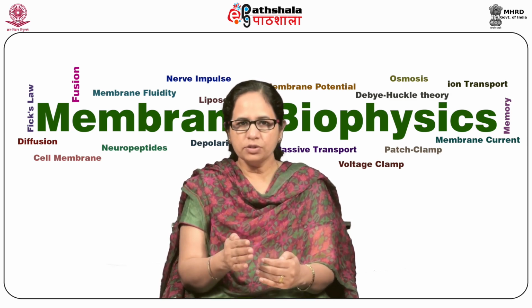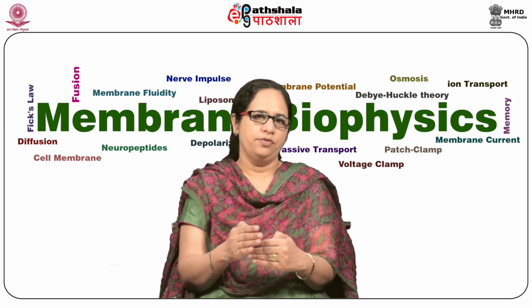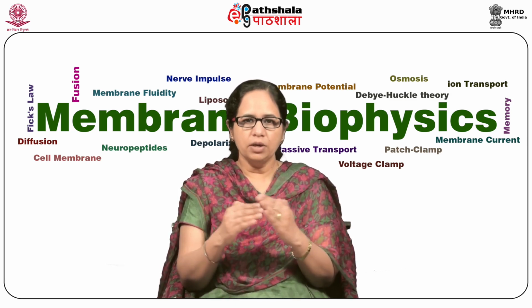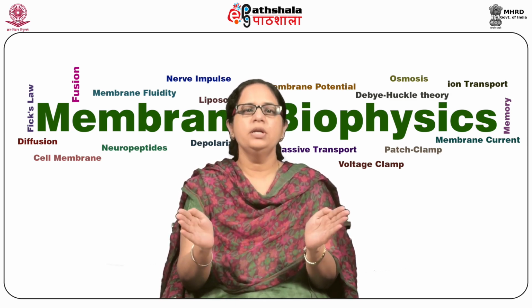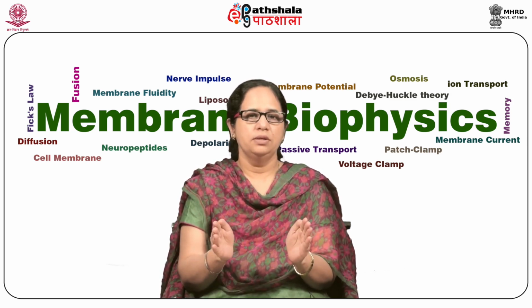The effectiveness of the voltage clamp stems first from the fact that it allows the separation of membrane ionic and capacitive currents.